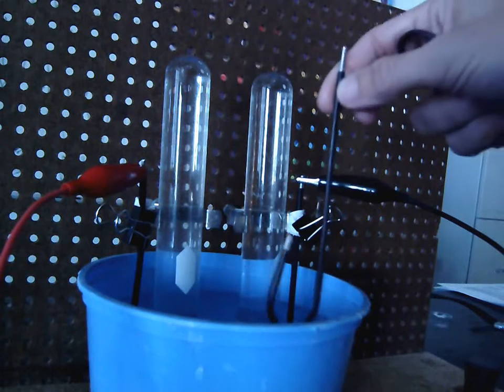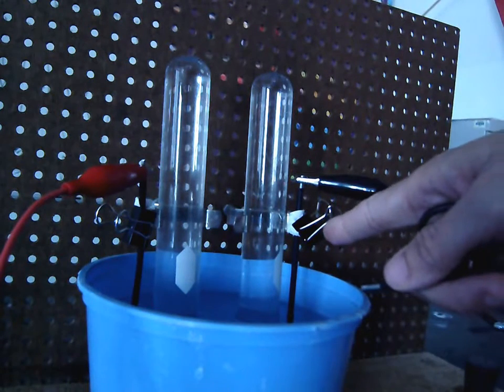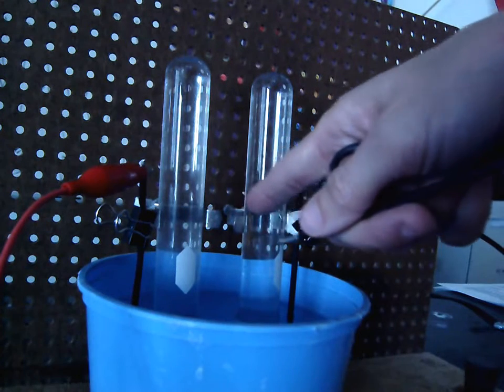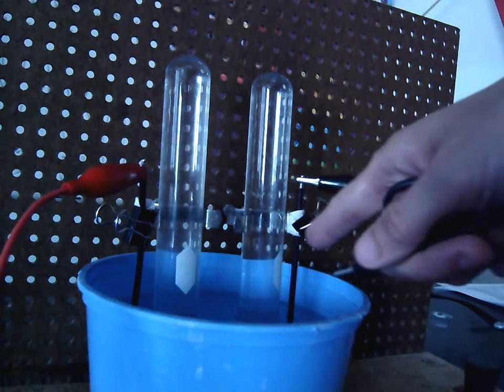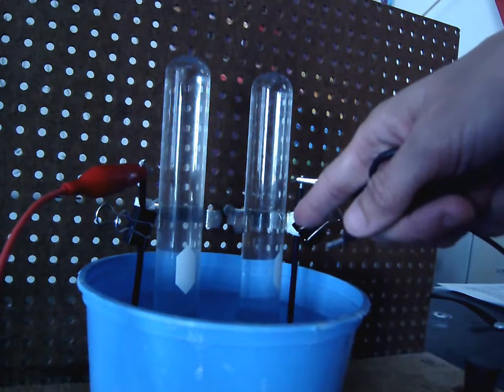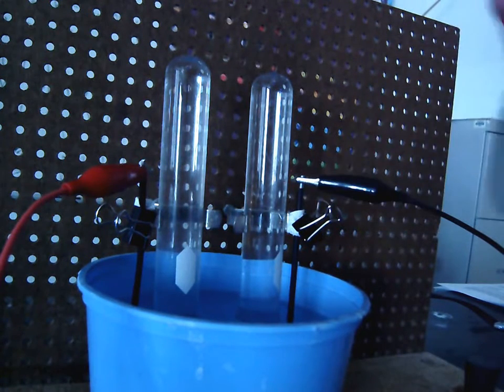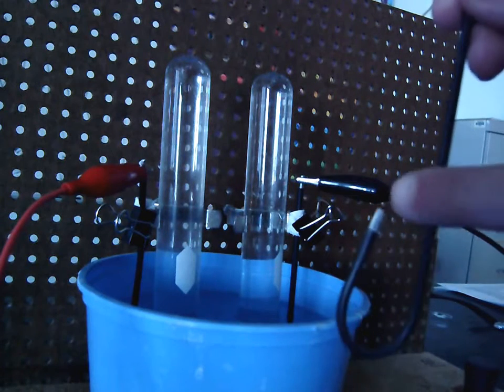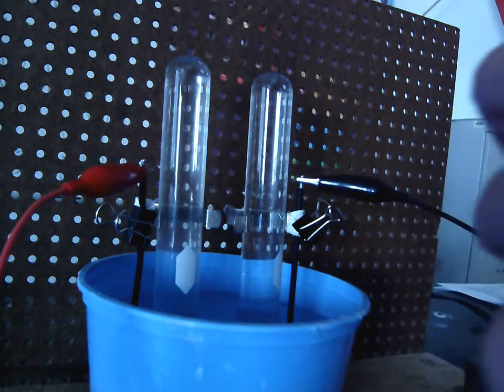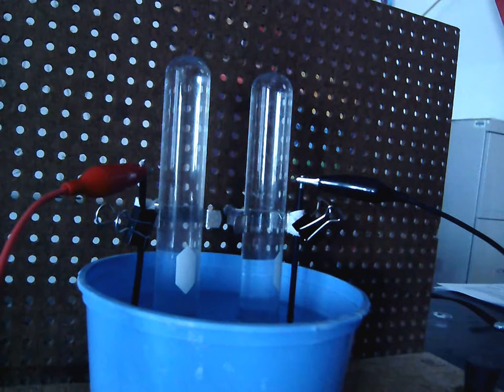So what we've done is I basically just took a little binder clip, and this clamp that's holding the test tube in place has a little arm that's kind of sticking out. So I took the binder clip and I just clipped the electrode to the clamp that's holding the test tube in place. Now what's important is that this part of the electrode, the end of it, is directly under the mouth of the test tube. So it's kind of like this.